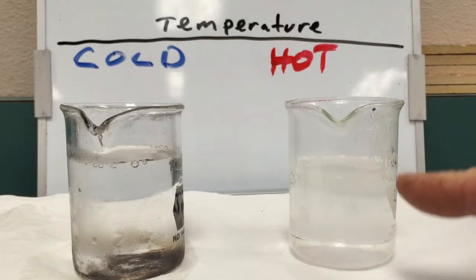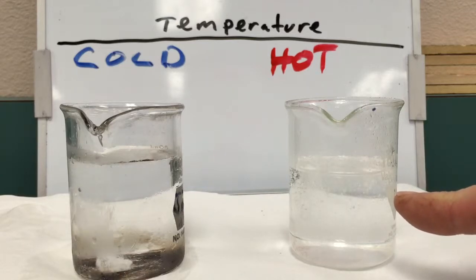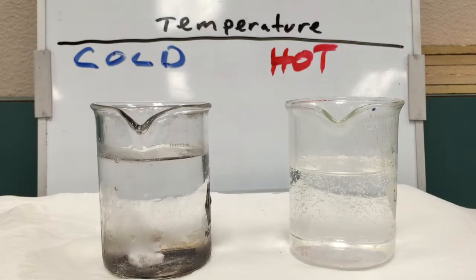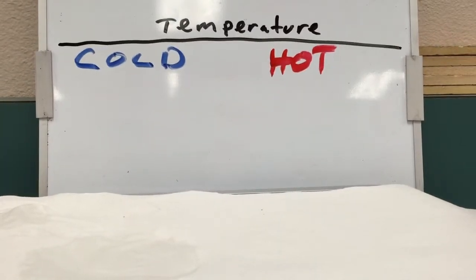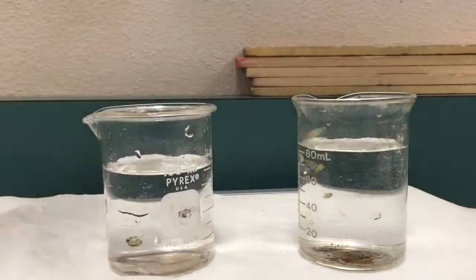You can see the hot water one has already pretty much stopped reacting. And you can see the cold water one is, in fact, still reacting. In fact, it'll probably go for a couple minutes. So the hot water reacts much faster than the cold water. Now, these are both at just tap water temperature.